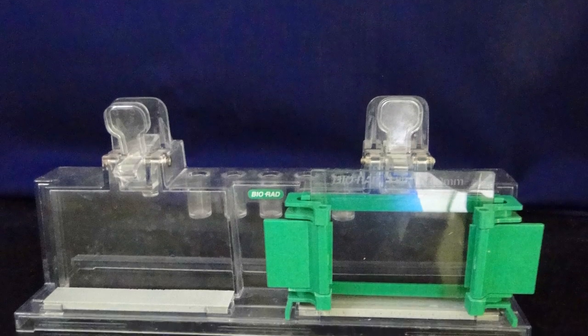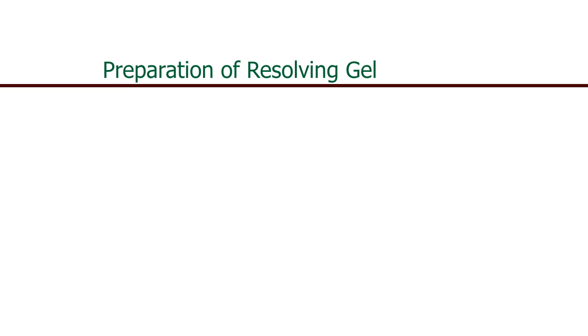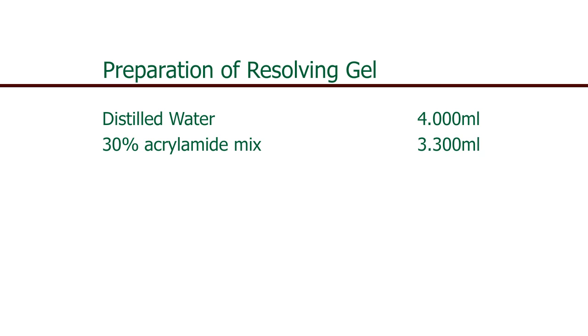Now cast the gels. For the preparation of the resolving gel, we require: distilled water of 4 ml, 30% acrylamide mix of 3.3 ml, and 1.5 molar Tris of pH 8.8 of 2.5 ml.